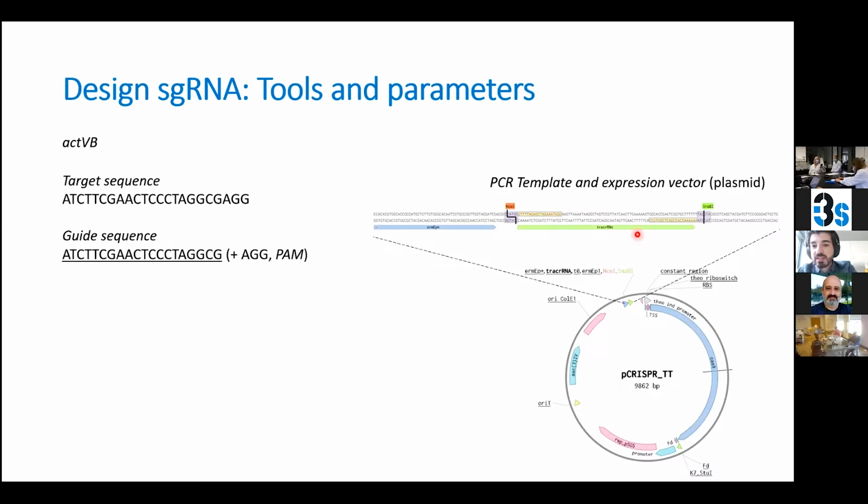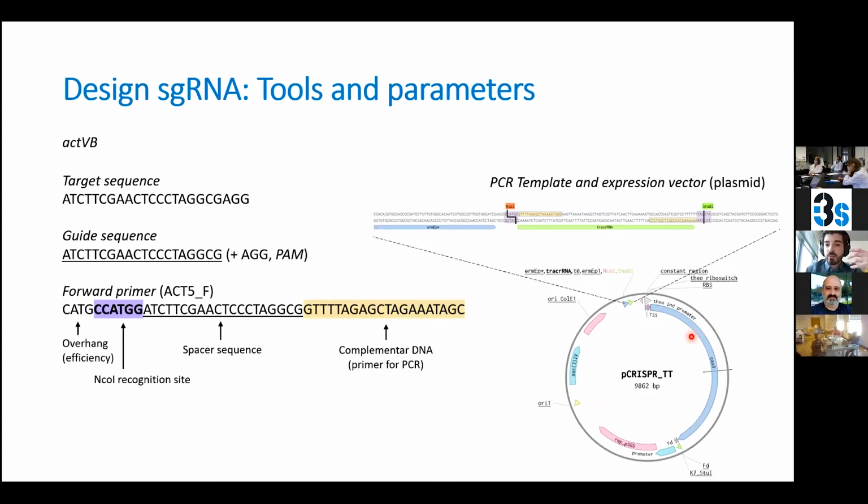Thankfully, the person that designed this vector was clever, and it includes, surrounding this region, two motifs that are recognized by restriction enzymes. Restriction enzymes are nucleases that cut the DNA. They are basically found in bacteria. In many bacteria, they have evolved to have these nucleases, and we use them in molecular biology because they recognize generally 4 or 6 nucleotides that are generally palindromic sequences, and they cut the DNA. And this is very useful because generally, what we do in a tube is that we take our DNA, in this case, the vector, we take these restriction enzymes, these nucleases, and we cut the DNA in vitro, and we end up with pieces of DNA.